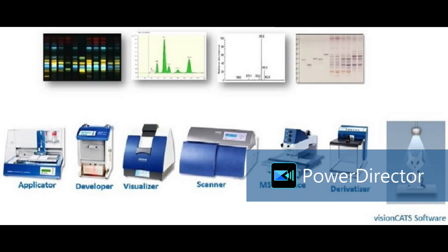Before starting HPTLC, what is chromatography? Separation of components of a mixture. We want to separate components from their mixture. That is our main motto behind any chromatographic analysis: HPLC, GC, GC-MS, TLC, HPTLC, paper chromatography. Behind that main motto is separation. Chromatography is separation science. We are separating components of a mixture.